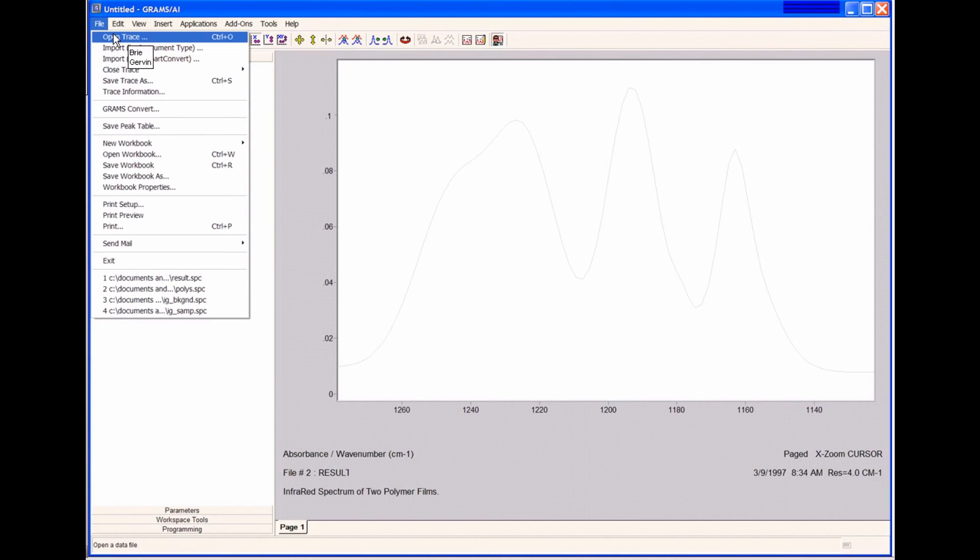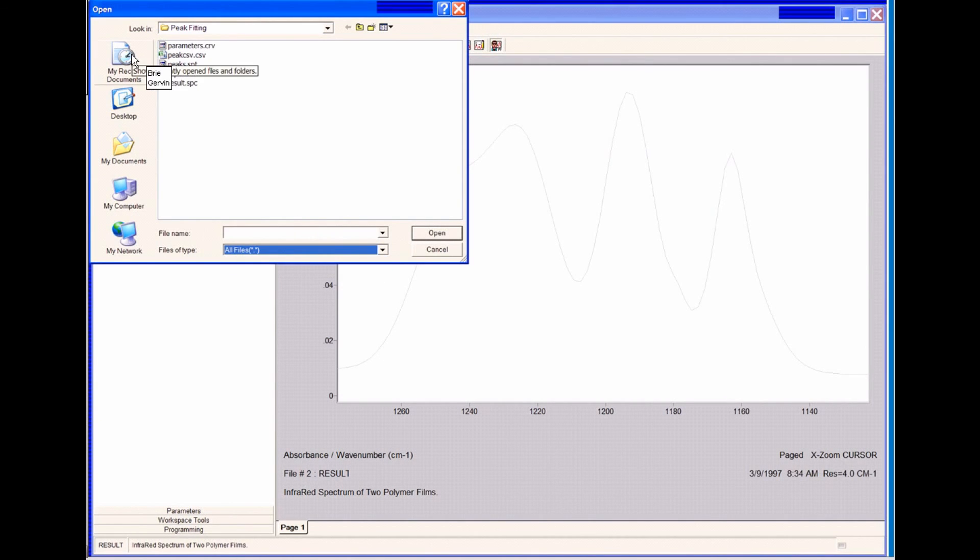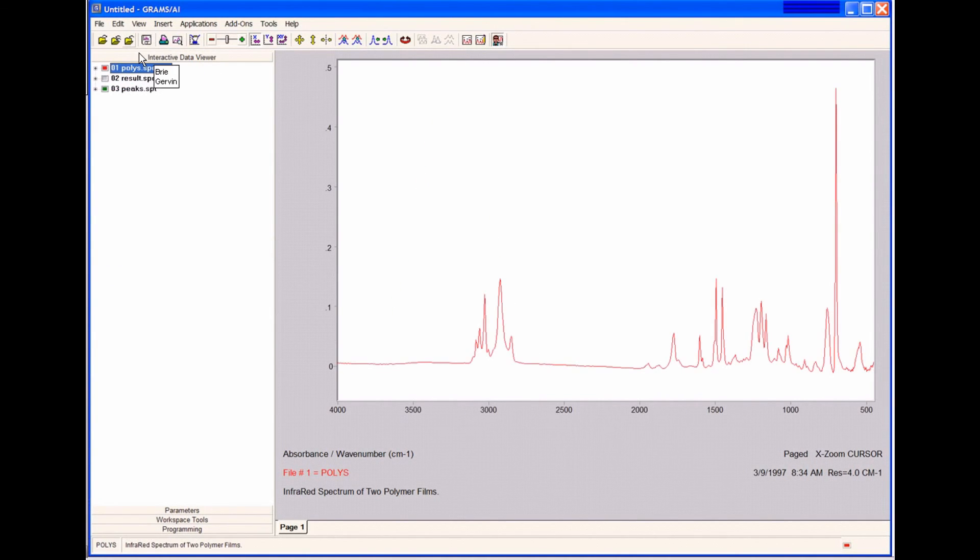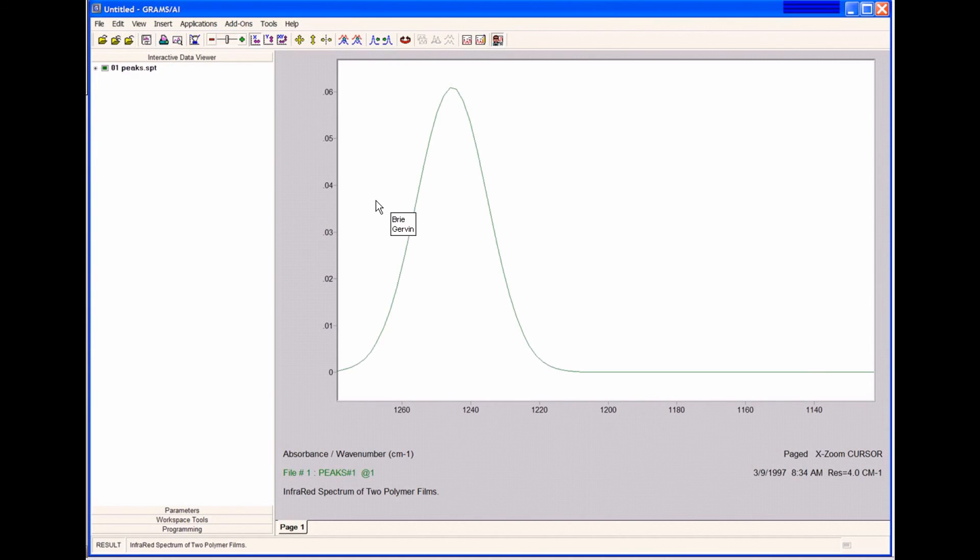I'd like to open up the peaks that we saved. I can open up the peaks file. I want to close the other files that we saved just so that we can see our peaks. As you can see, this is a multi-file. Here's the first peak.